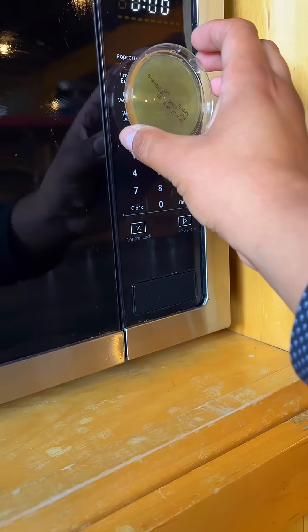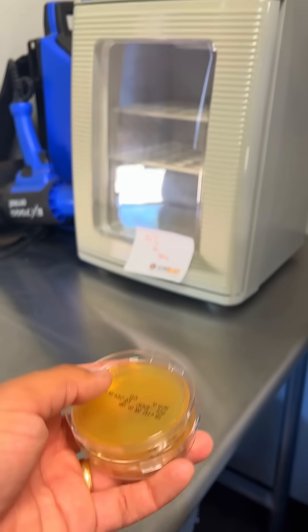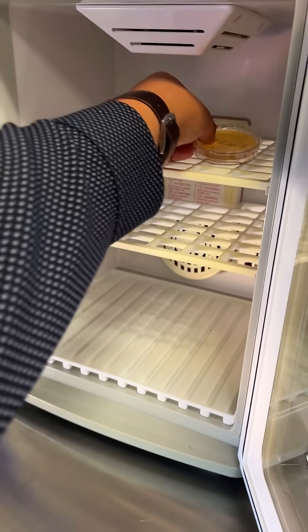After wiping, we take another sample. This will show us what's left behind. Both samples then go into the incubator to see what grows after 24 hours.